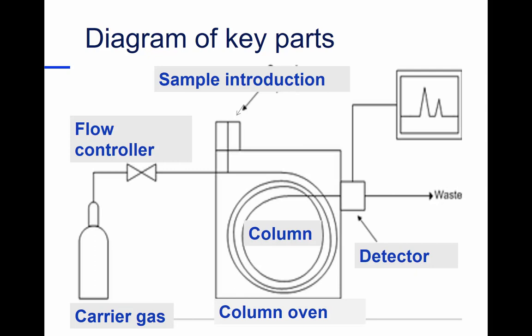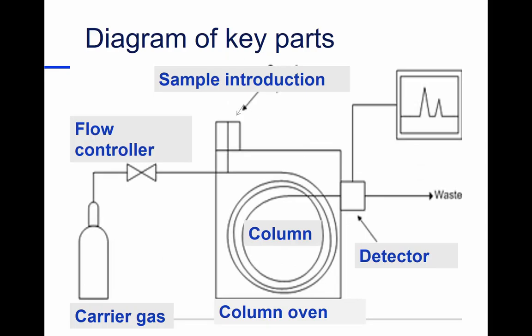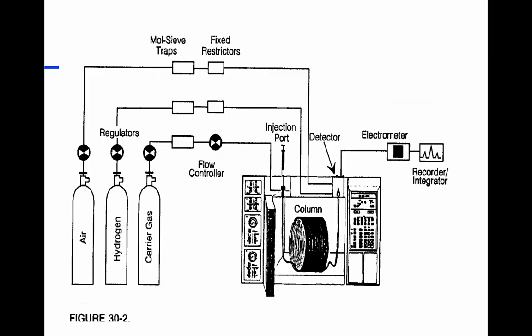And this is going to be the hot part, the injection port. So my sample gets injected in here. It can then go through the column and go through the detector and ultimately generate a chromatogram. We're going to watch those peaks come out as they elute from the gas chromatograph. That's the simple version. Life gets a little more complicated in reality.